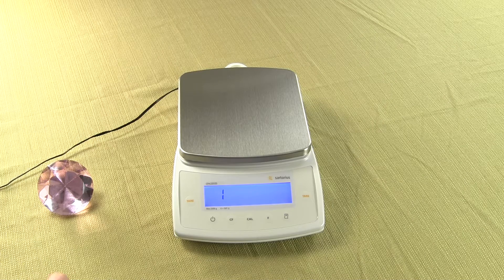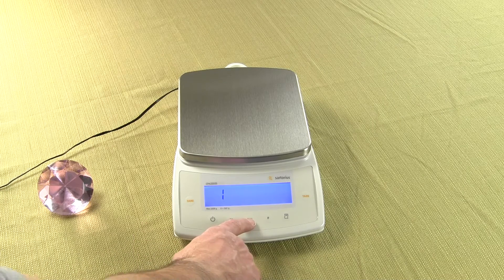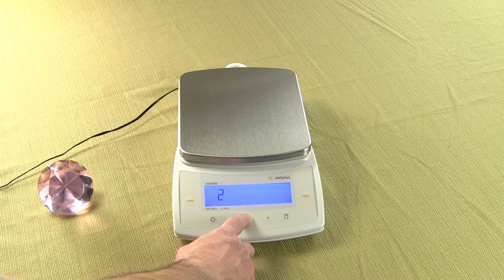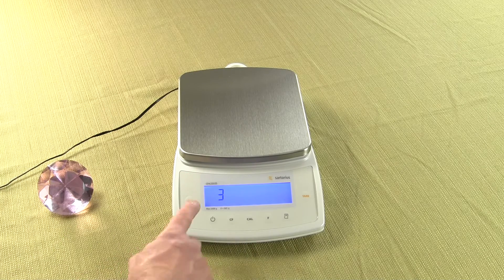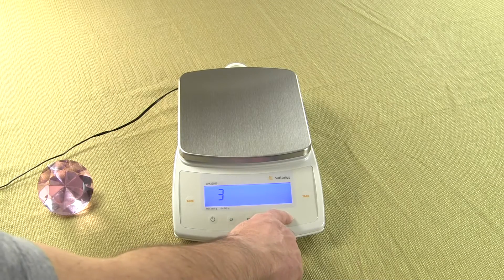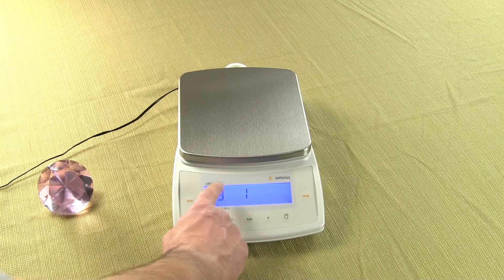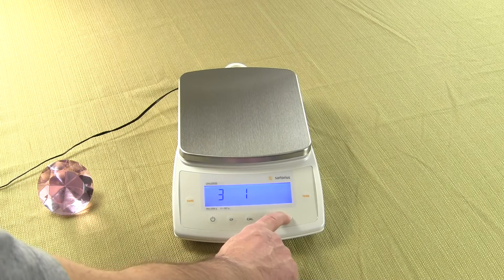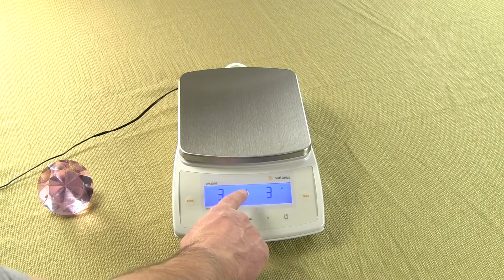So we need to increment the number 1 — we want to change that to 3. Press the Cal key once, twice. Now we have a 3. We need to move it over one. To move it over to the right, press the Print key. We have 3, 1. We want to keep the 1 there. Press the Print key again. We have 3, 1, 3.